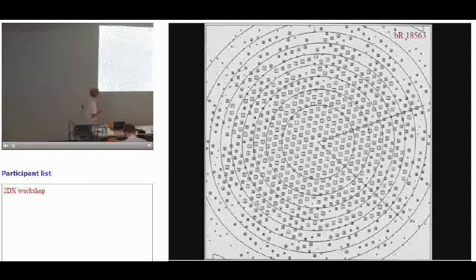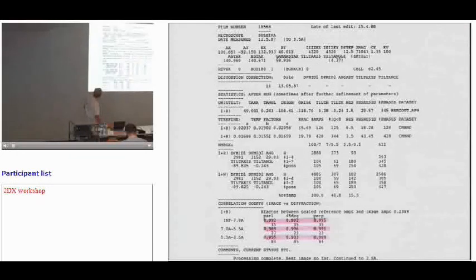So this was our best ever purple membrane untilted image that Fritz Zemlin took in Berlin, and it goes out to 2.8 angstroms. And in order to know what we were doing and to be able to hold in your head what's happening to all your different micrographs, we created summary sheets like this, which I think is still a good idea, particularly if it's a new project. So you can see this is quite an old one.